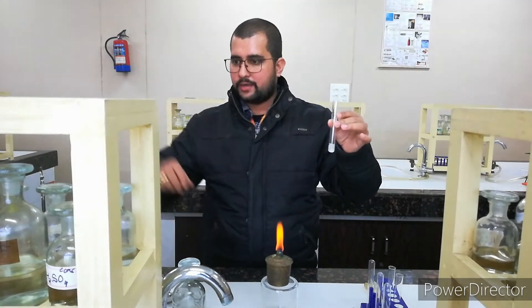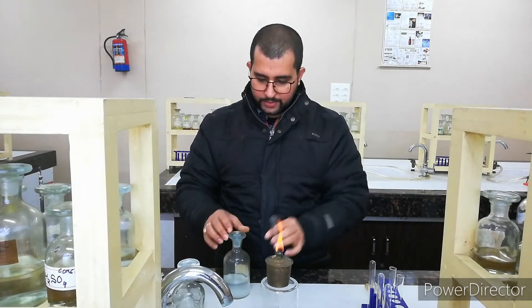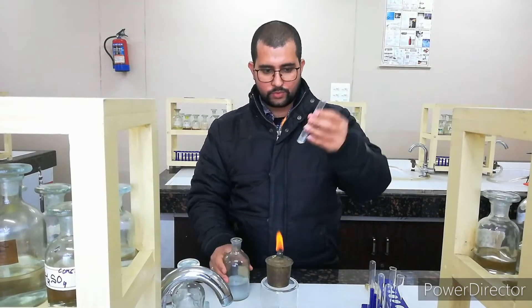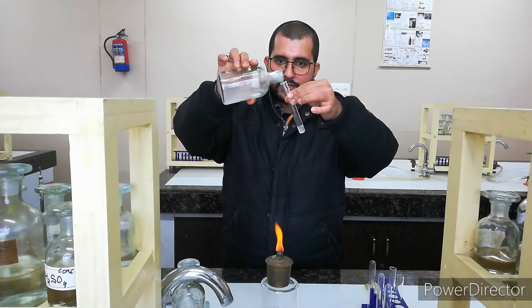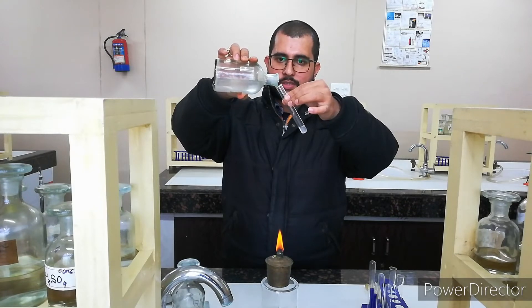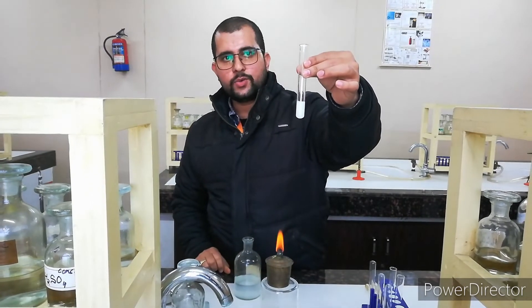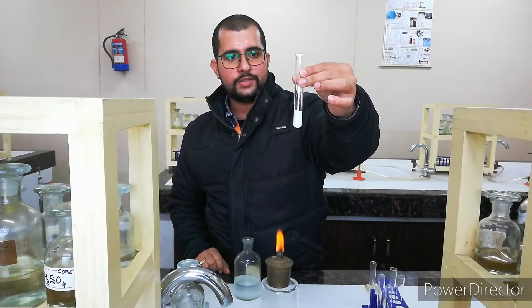I am going to add barium chloride here — this is your barium chloride — and I am adding it little by little. We will observe if sulphate is present or not. I am adding BaCl₂ slowly. Yes, you can observe it — a white precipitate is forming here. So it means that in this given sample, sulphate is present.